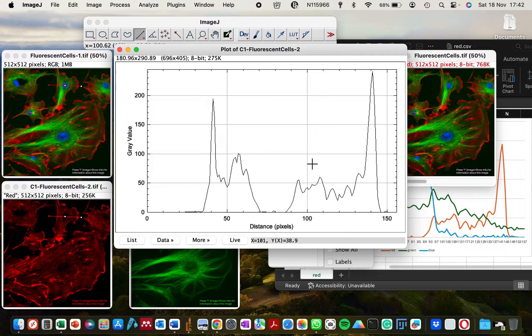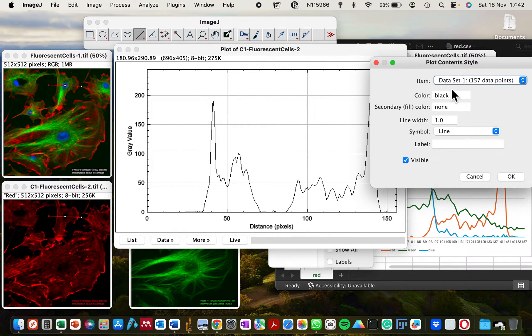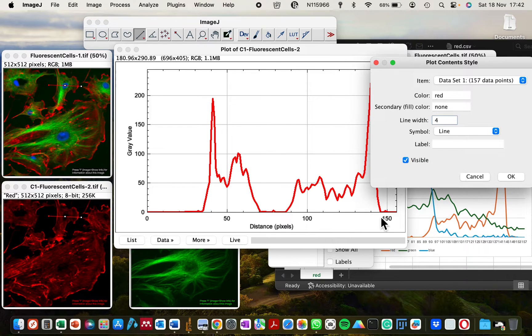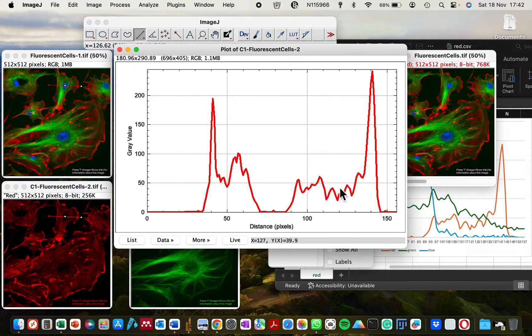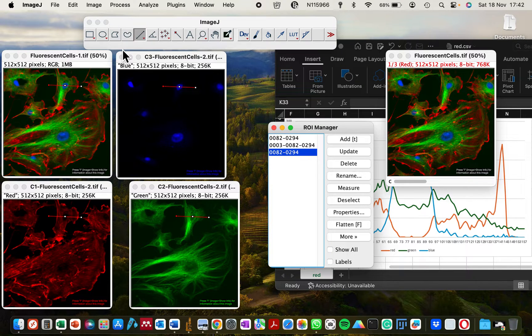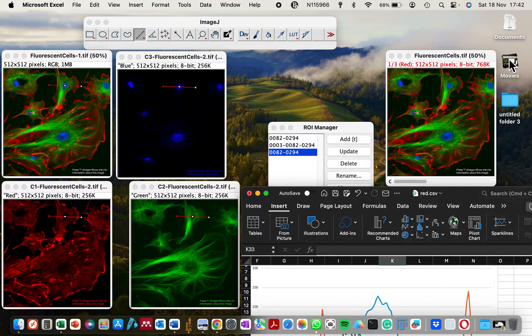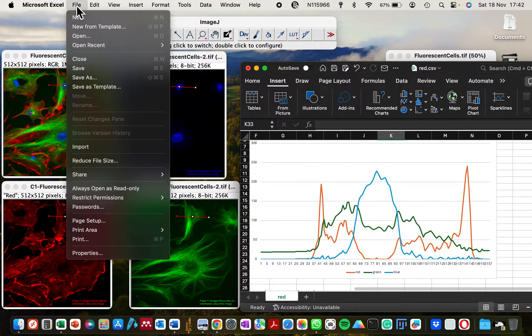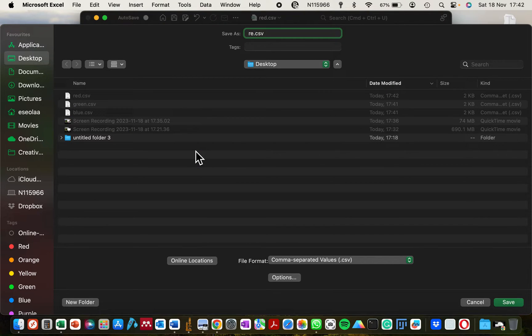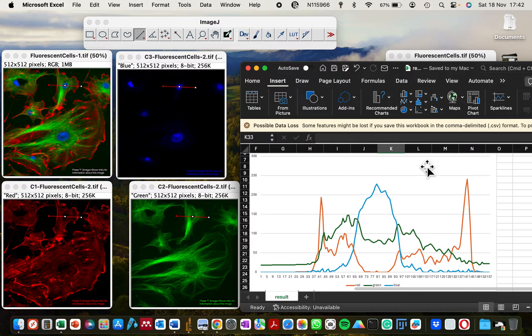Now that we've saved these three channels individually, if you want to plot them individually in ImageJ you can go to 'More,' then 'Content Style,' and change the color to red for the red channel and increase the line thickness — this is one of the functions the RGB profiler would have done in a single step. Since that is not working well, let's move to the Excel document.